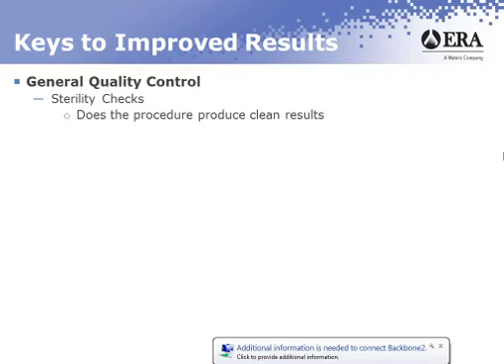For multiple tube procedures, again, you want to check sterility of media, buffer dilution, and your glassware. Each new batch of any of those materials, when they show up, you should check before you put them into use.